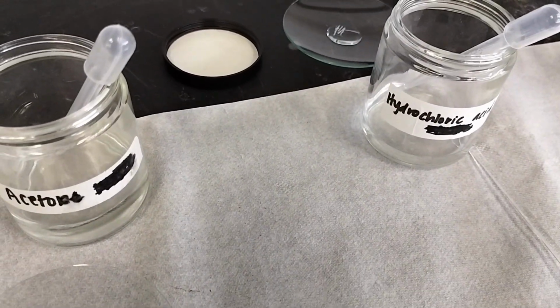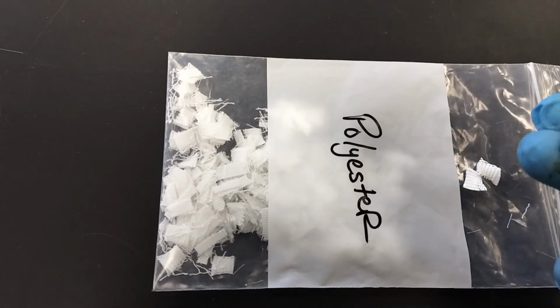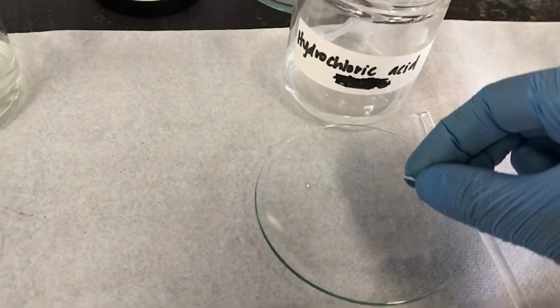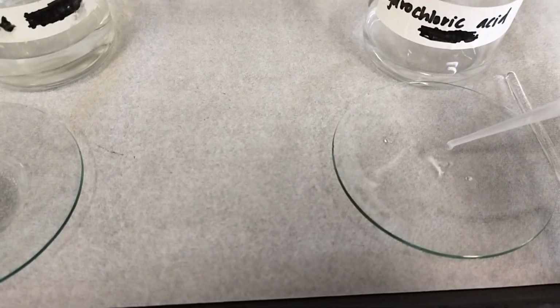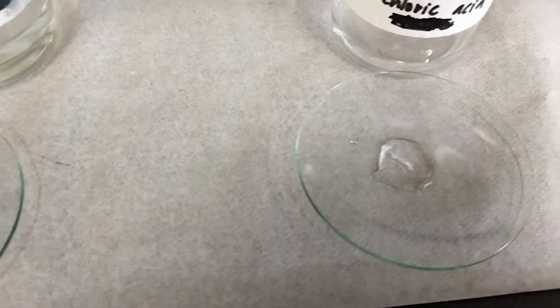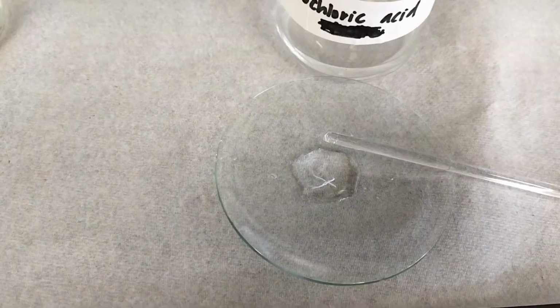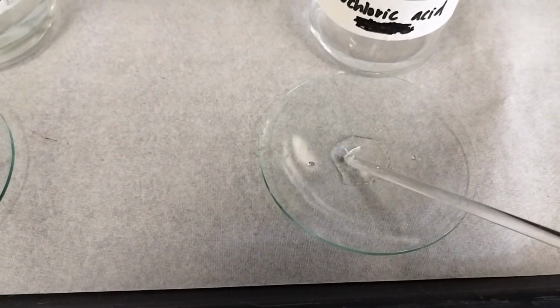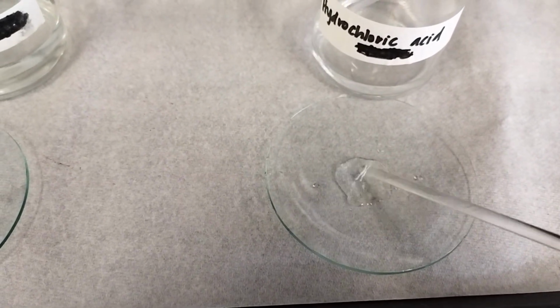Since this fiber did not dissolve in acetone, we will now test it with hydrochloric acid. If the fiber dissolves, we can conclude that the sample is nylon fiber. After waiting a few minutes, we can see that the fiber did not dissolve in hydrochloric acid. This confirms that the sample is not nylon. So we will proceed to the next chemical test.